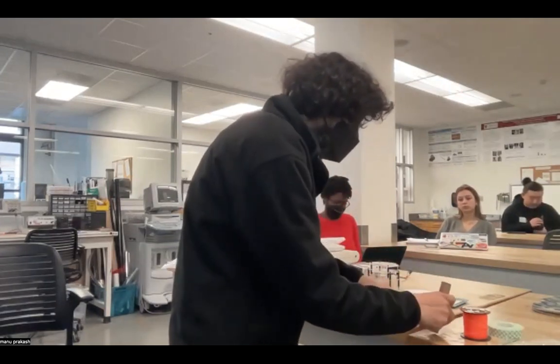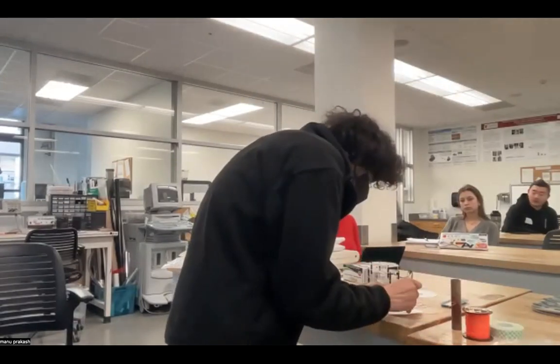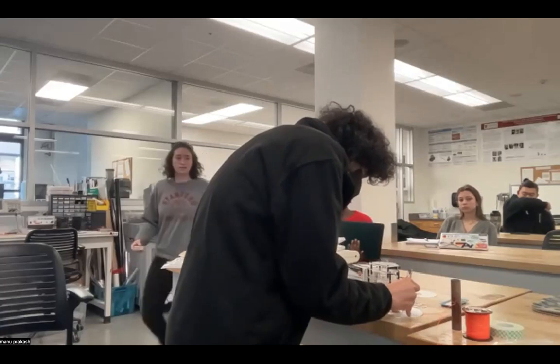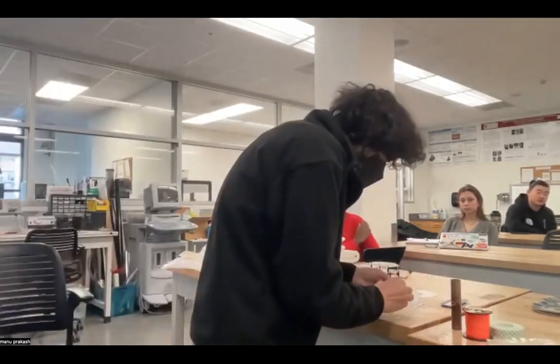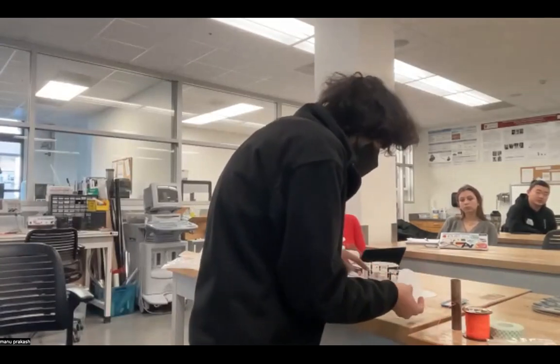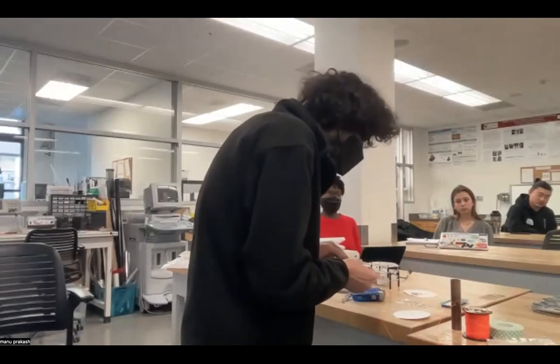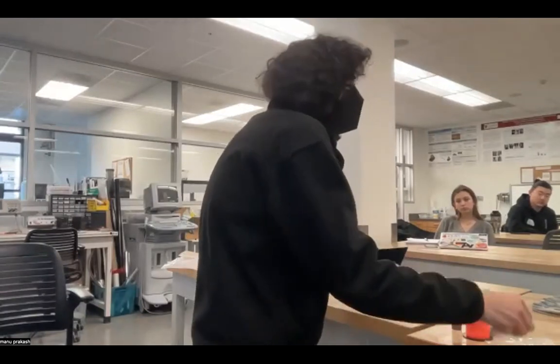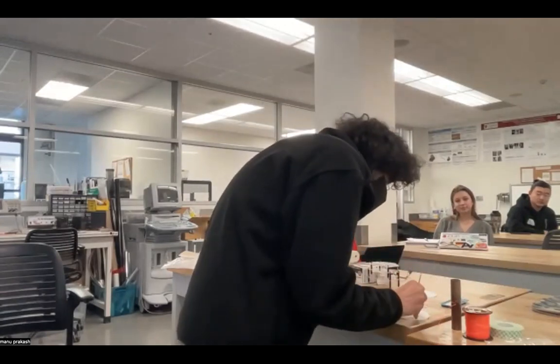And then, of course, one of the key threads is exploring for the fastest ones. Oh, perfect. Why don't I do this? We'll do this as an experiment. I have this other double-sided tape that I've never tested, and I'm going to test it to see whether it fails, and it'll give us the actual experiment.